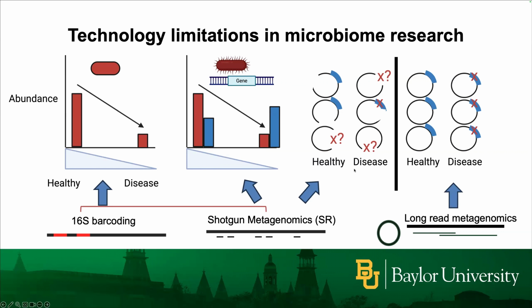And one of the challenges with short reads is that while you can get partial genomes, without having a complete genome, it's really difficult to actually compare and do pangenome analyses or comparative genomics of these microbes, because one or two genes missing could be really important. And in most of the cases, you could only have 10, 20, or even 30% of the genome missing.